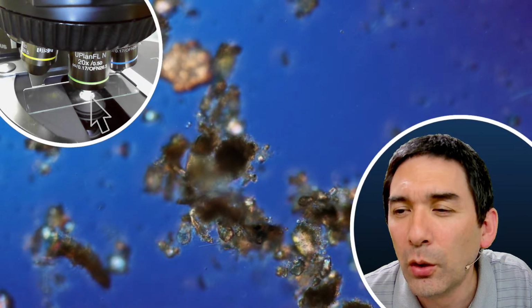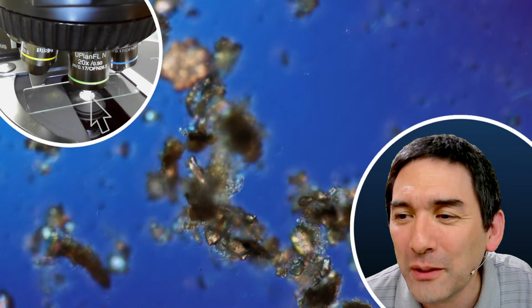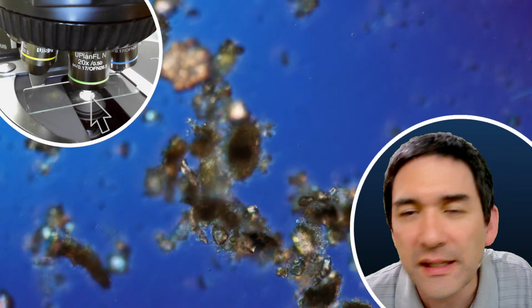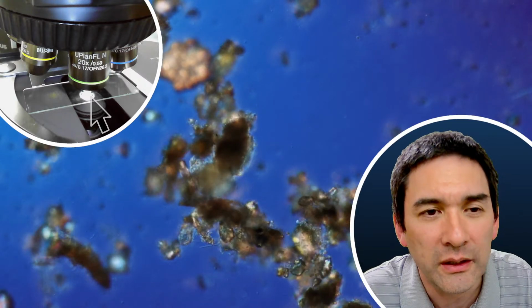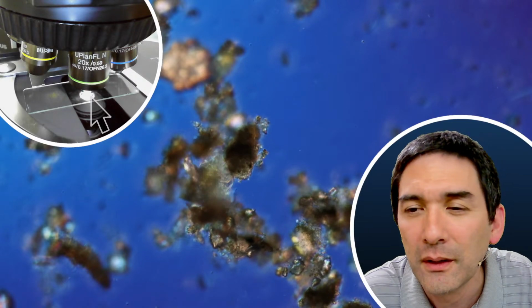Google should make a whole library of microorganism emojis. Yeah. I took a sample of water from a big puddle that formed in my field from snow melting, caught a mosquito larvae in it. Yes. Generally, there is the saying that a puddle should be a few days old. And if a puddle is a few days old, generally you're quite successful in finding something interesting.